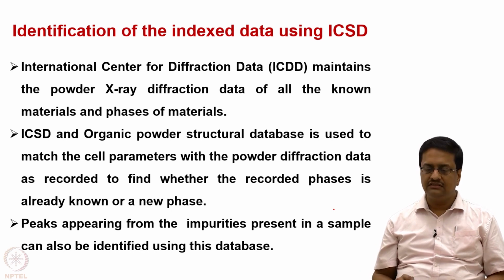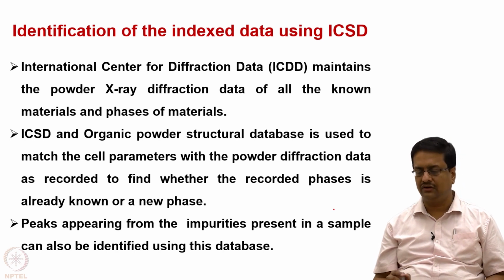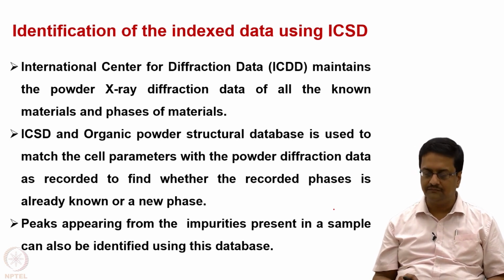What one can do is identify the indexed data using ICSD. The Inorganic Crystal Structure Database is maintained by the International Centre for Diffraction Data. It actually now maintains both inorganic and organic powder X-ray diffraction data.